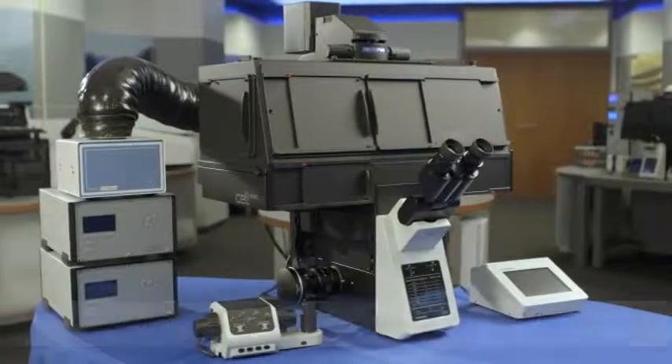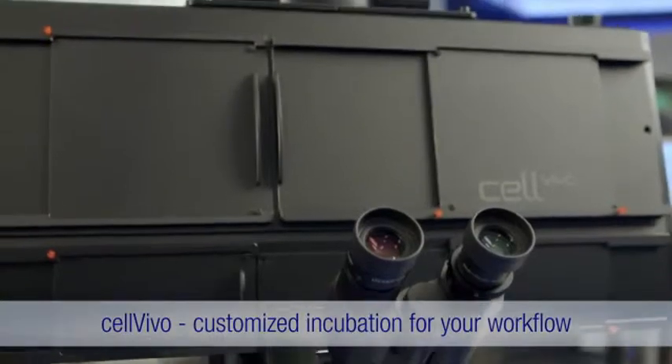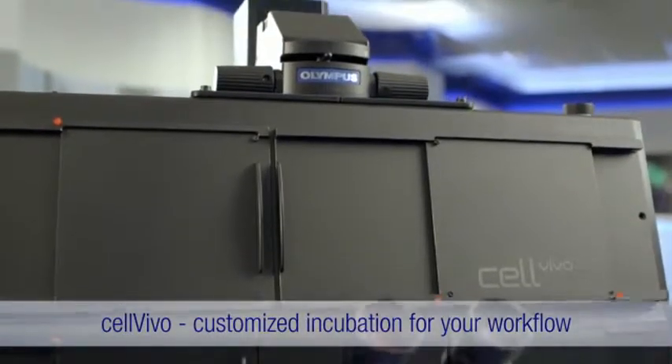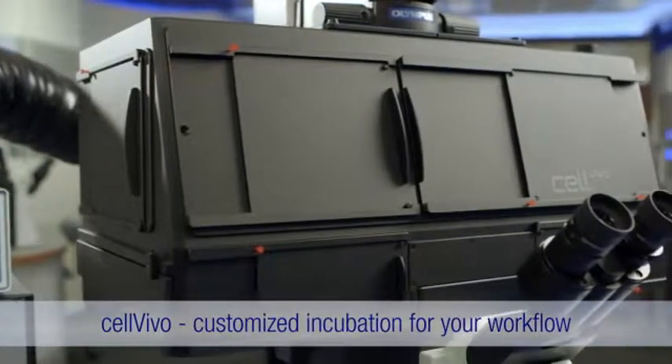It's never been easier to create an environmental control system to suit your workflow. Achieve the highest quality live cell imaging results with Cell Vivo, the modular and flexible incubator from Olympus.